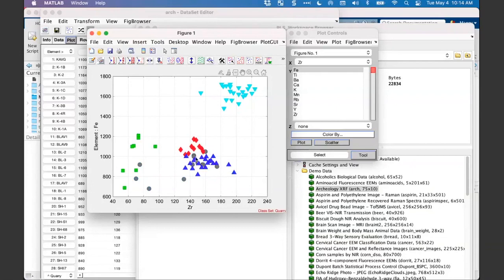And what you see there is that we have 5 classes. I'm going to press the legend button to make that legend appear. There you go. And one cool thing is that you can move things around, so I can place that legend wherever I want. So we have 4 classes and we have a class 0. That class 0 means that it is not assigned. Those samples are not assigned specifically to any class just yet.